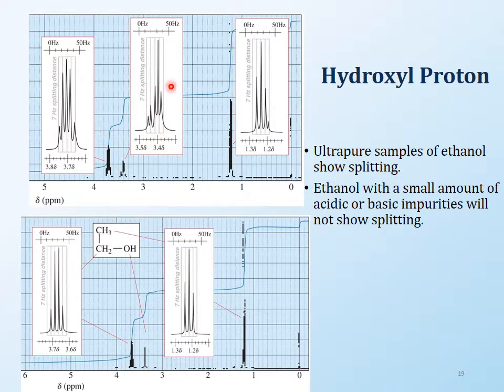This is the better NMR. So the triplet, the quartet, the CH2, CH3, that gives you the triplet and the quartet and the singlet. That is what you will see normally for ethanol. But in a really good sensitive environment, you will see even more complex splitting. So depending on your instrument, if your instrument gets better, then you start seeing more splitting. So you have to be careful with that and know that you have a better instrument or you have a really good sample also.